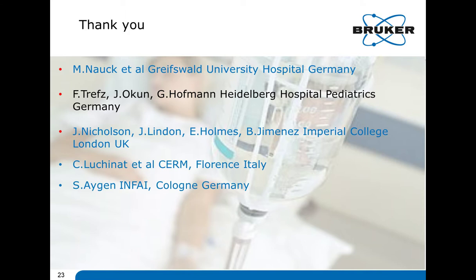This was an example to show that in general clinical chemistry, when we change our platform, we observe in many cases relevant shifts between platform A and platform B. And this is one of the real advantages of the NMR spectroscopy, that in this view we do not have any changes in accuracy.